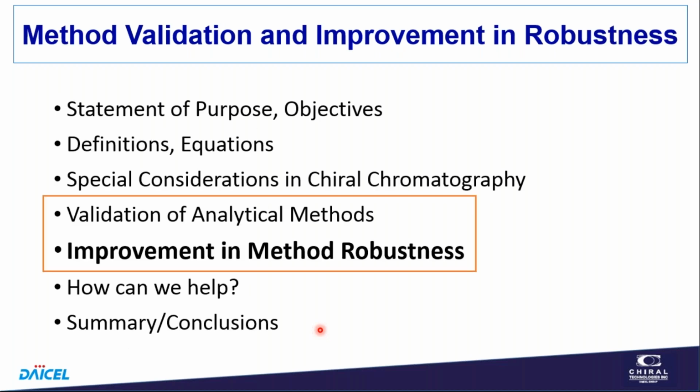Improve method robustness. I have these listed in this order, but I think as part of method development, you want to do the method robustness. You don't want that to be a test that you run later and are surprised by the results. In fact, I think you want to already know what's going to happen from validation. You should have already done some of the experiments around validation to know how well your method's going to work before you hand it off to the group that might validate the method. So the validation should really just be a formalization of what you already know. Method robustness, I think, is something that should be incorporated in your method development.